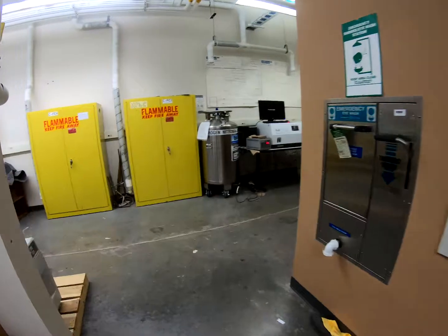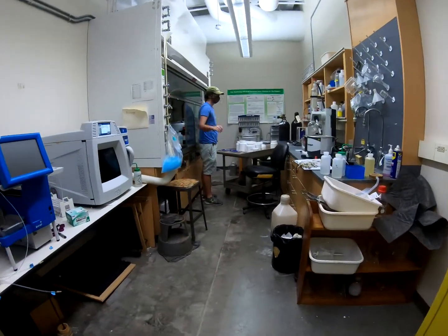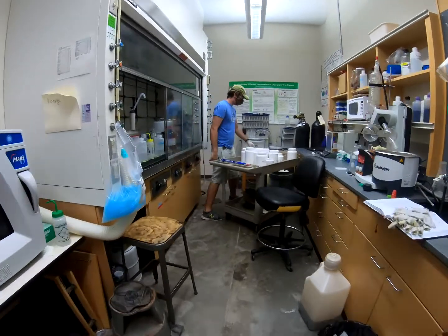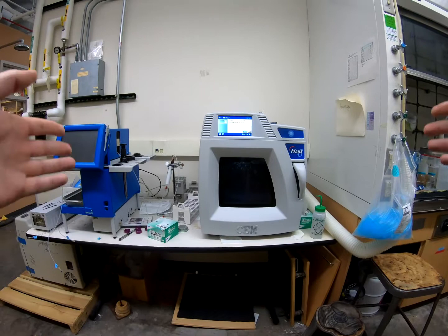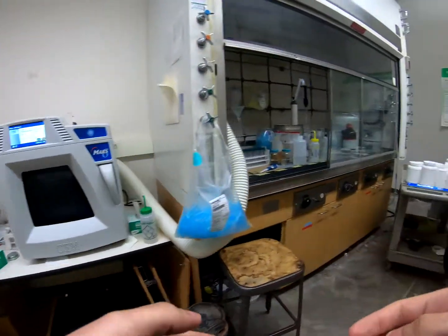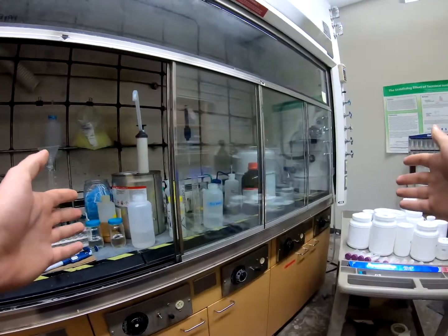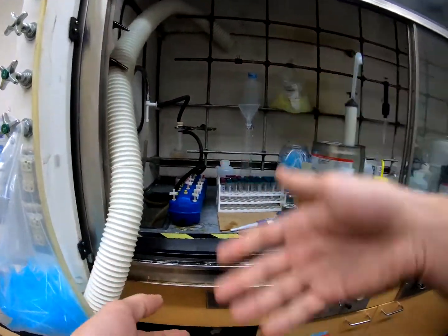Coming around the last corner here, we've got Brian weighing out some peptides. Hi, Brian. And the same sort of microwave setup that we have seen in the other lab, Lab B, where we have a microwave as well as chemicals that we use for the actual synthesis and the aspirator to drain off solvent.